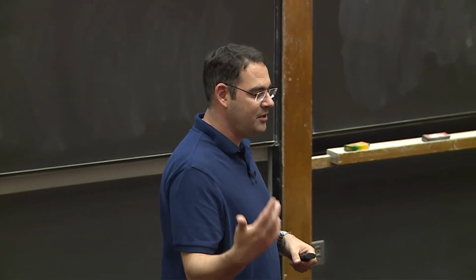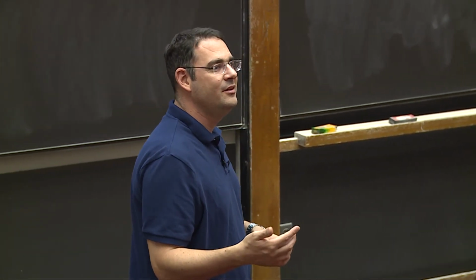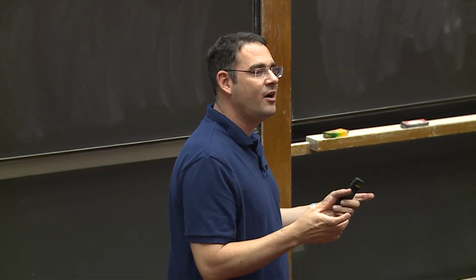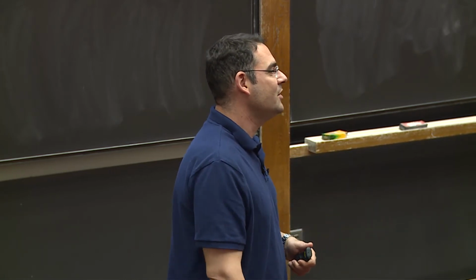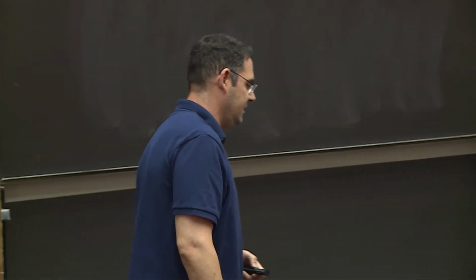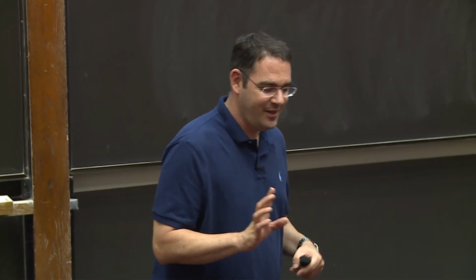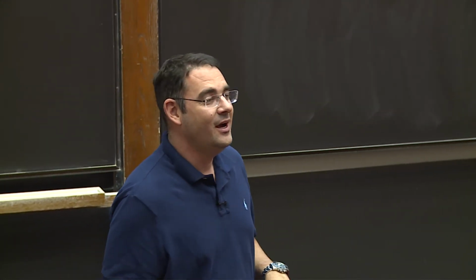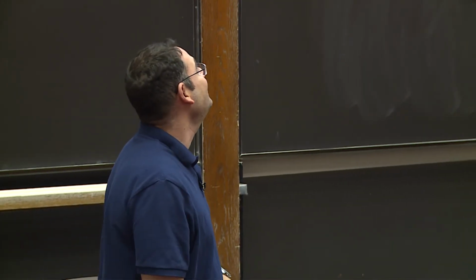I mean, there is a notion: they do many reconstructions, and they define something called RMSD, that gives you an idea of how far different reconstructions are from each other. But also in CryoEM, the definition of resolution is, let me say, under debate, to say the very least.